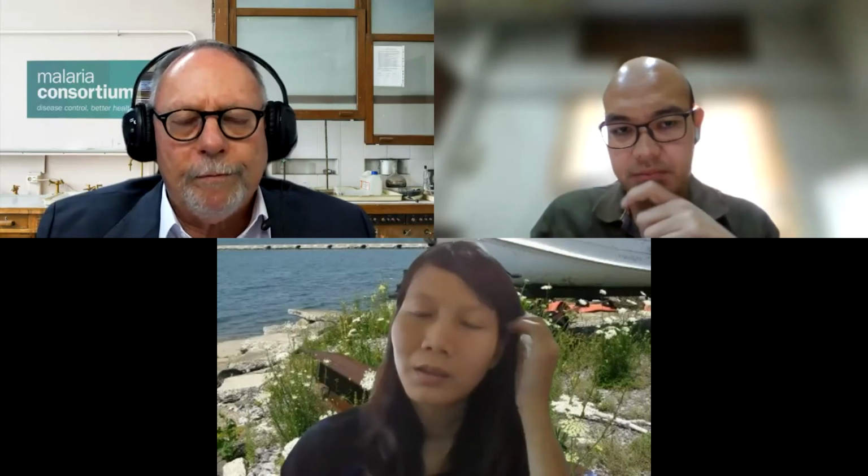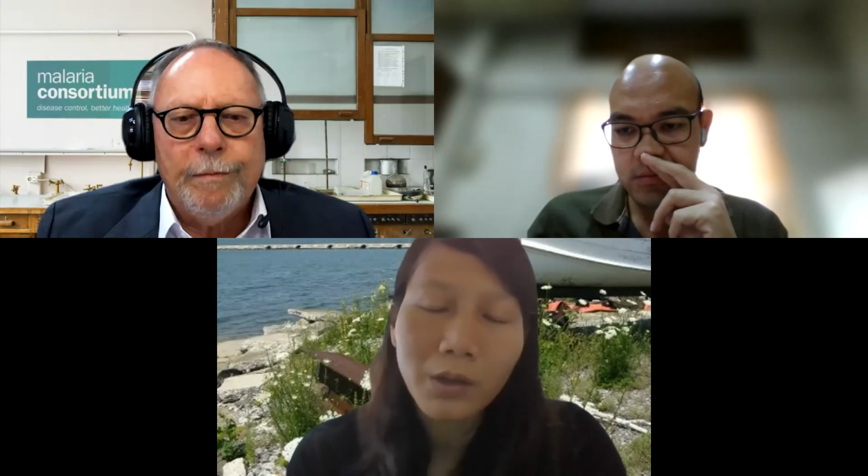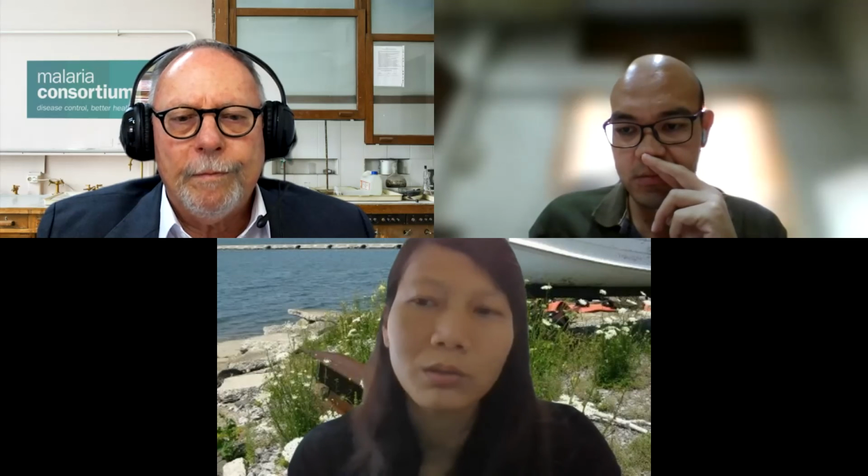Okay, Dr. Rajdawan, please answer. In this question, I don't think we can use mixed species in the cone or bottle assays. First of all, different species present different mechanisms to respond to the chemical.